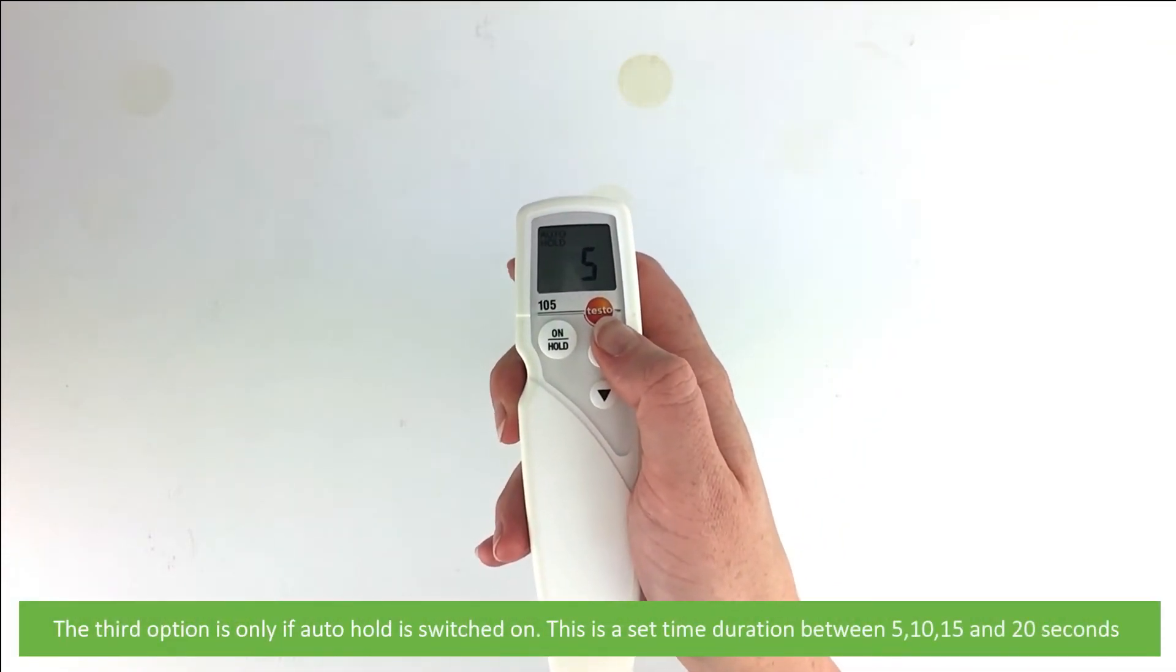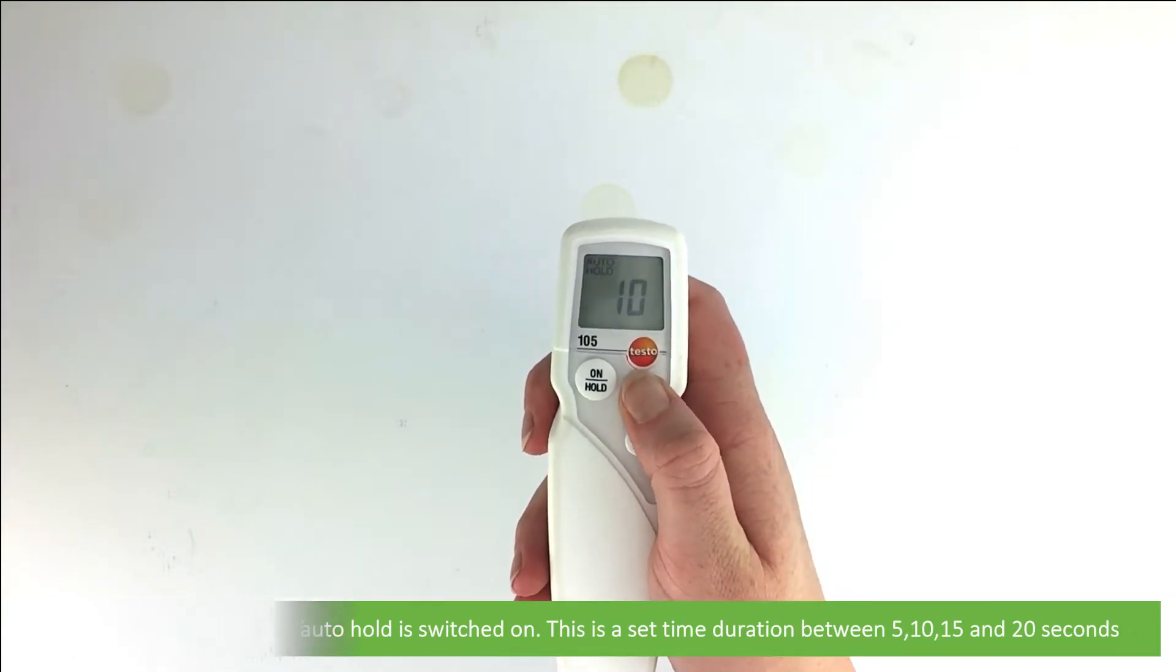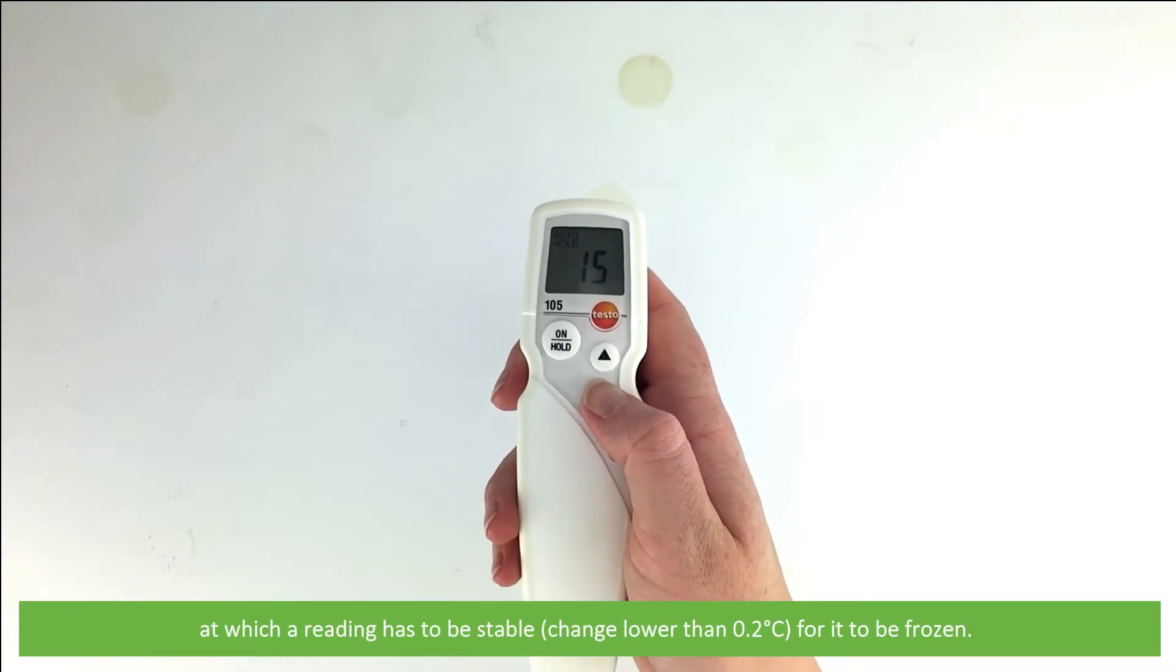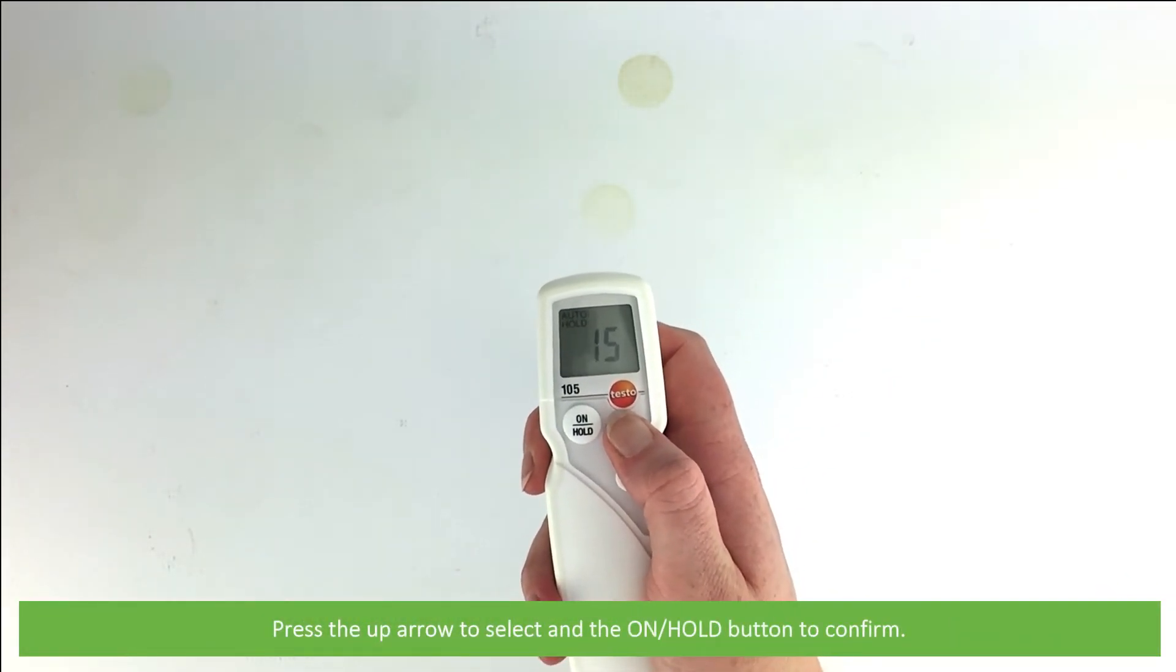The third option is only if auto hold is switched on. This is a set time duration between 5, 10, 15, and 20 seconds at which a reading has to be stable—that's a change lower than 0.2 degrees Celsius for it to be frozen. Press the up arrow to select and the on hold button to confirm.